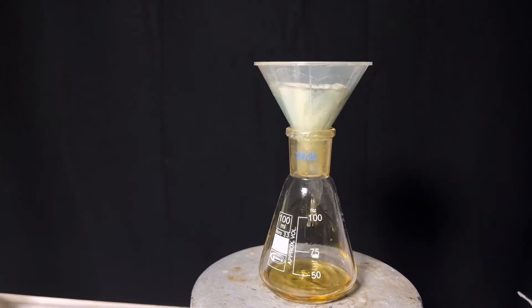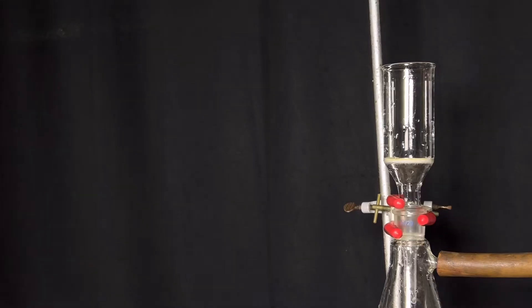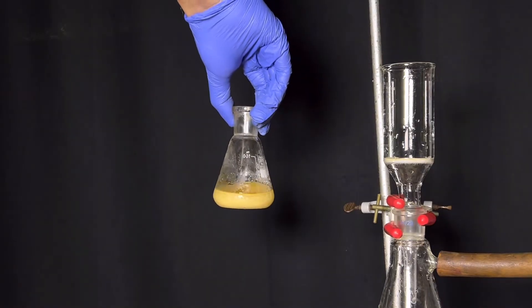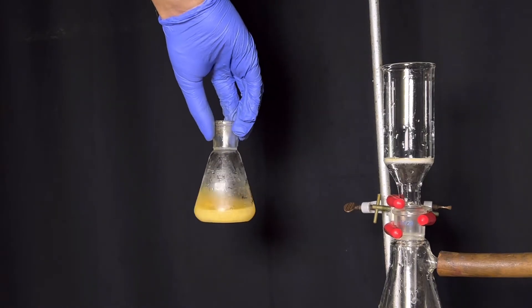Then the hot solution was filtered and the filtrate was allowed to cool to room temperature. After cooling it to room temperature, it was placed in a refrigerator overnight. The next day we got colorless plate-shaped crystals, and the final yield was 2.2 grams.